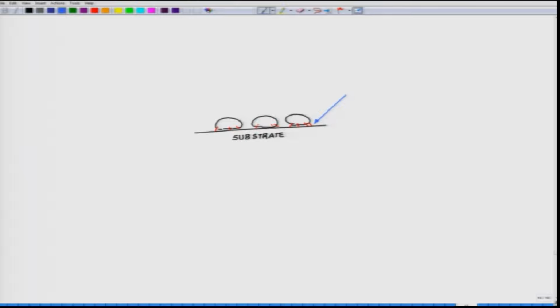And for surface analysis, this is one of the most powerful tools. What you see is not a bulk property of the material, but a surface interaction between a cell and a surface.